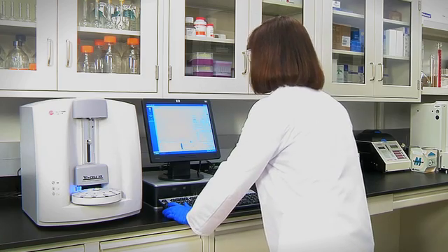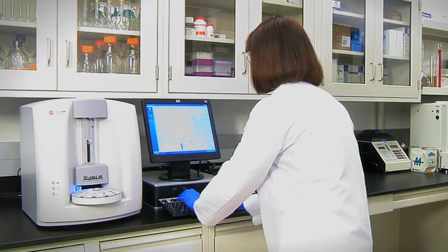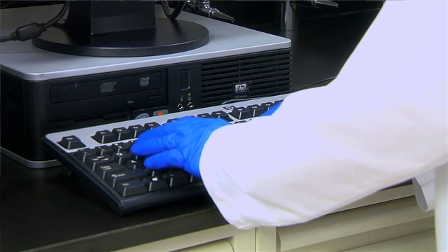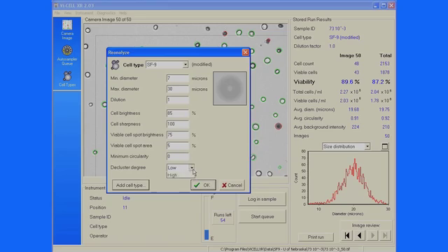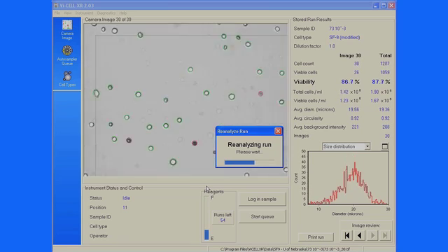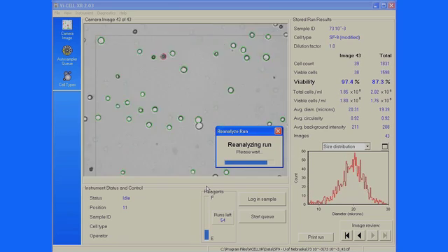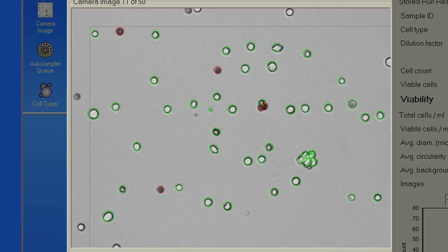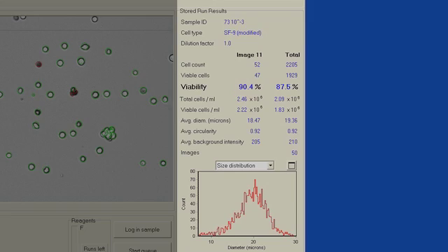The collected data is automatically analyzed and saved for easy archiving and reanalysis. The ViCell system's intuitive software allows you to easily view your results in a variety of forms. The ViCell software screen is divided up into two portions: an image portion and a statistical portion.